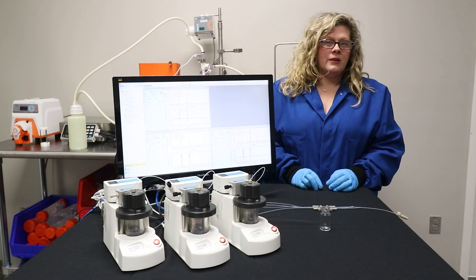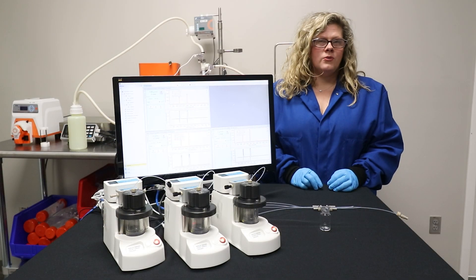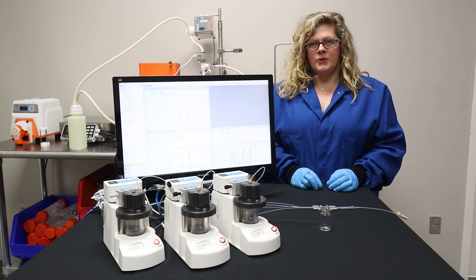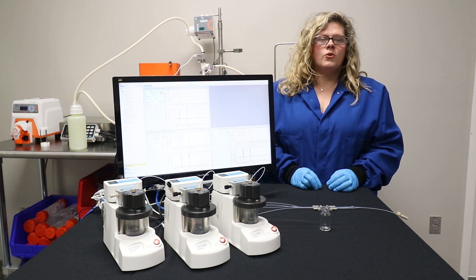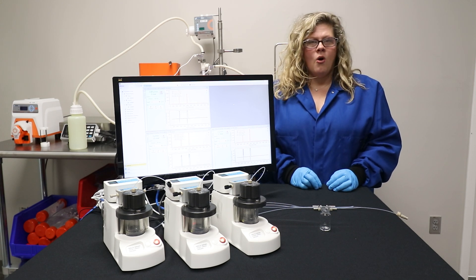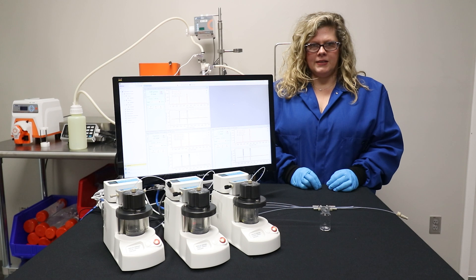Once your LNPs are produced, you may have to incorporate an additional process operation like TFF, dialysis, size exclusion, or centrifugation, in order to remove excess ethanol or unincorporated nucleic acids.